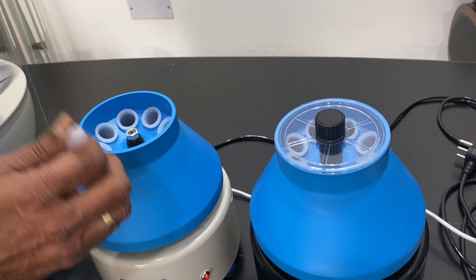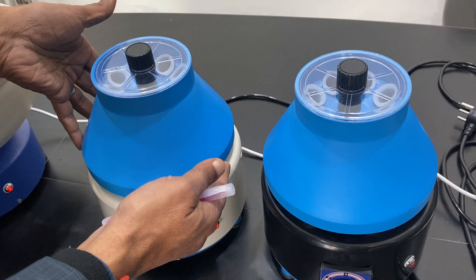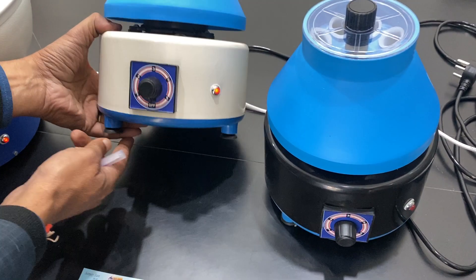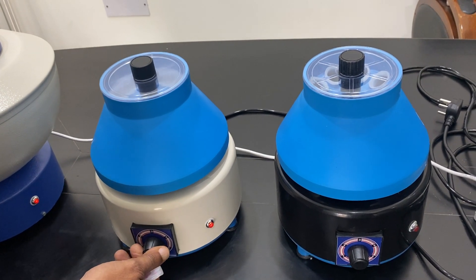You should put a minimum of two tubes at a time — one with the test sample and another with the same quantity of water for balance. Close it properly. Never lift it from here; lift it from this side. There are rubber feet to prevent vibrations. Then you can just switch it on — see, this is balanced.